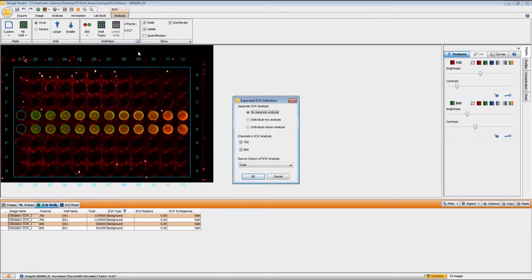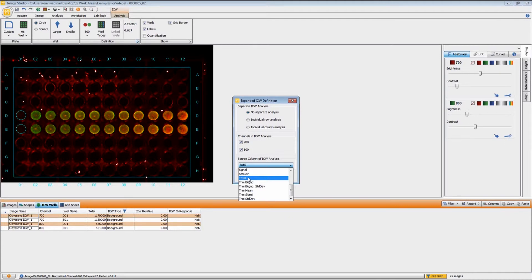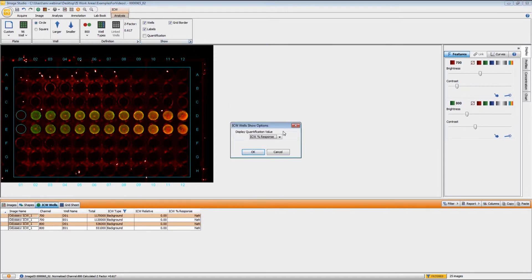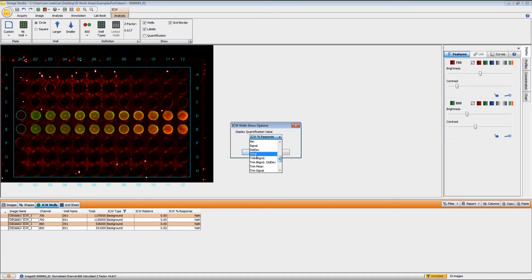There are a few things you can do with the options for these groups. Under the Definition group, you can do individual rows or individual columns, and normally Total is the source column most commonly used. Under the Show group, if you have data displayed on screen with quantification turned on, the default setting is ICW Percent Response, but you could also have the Total displayed — it is completely up to your choice.